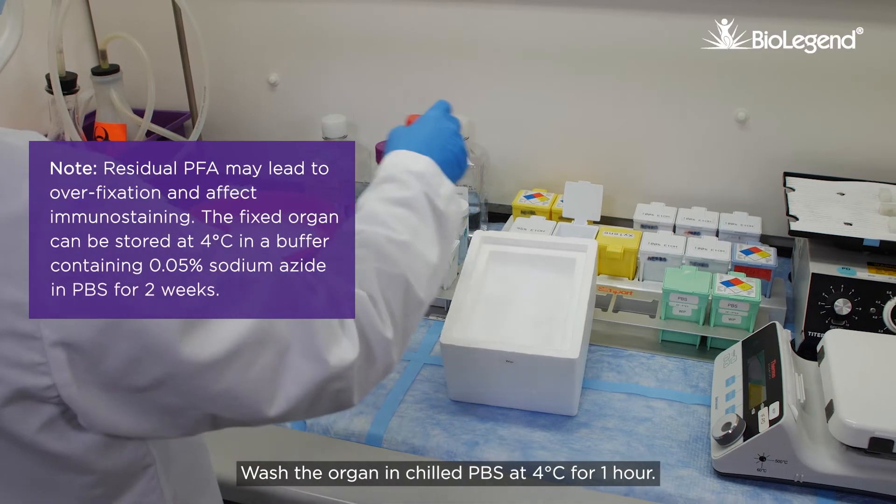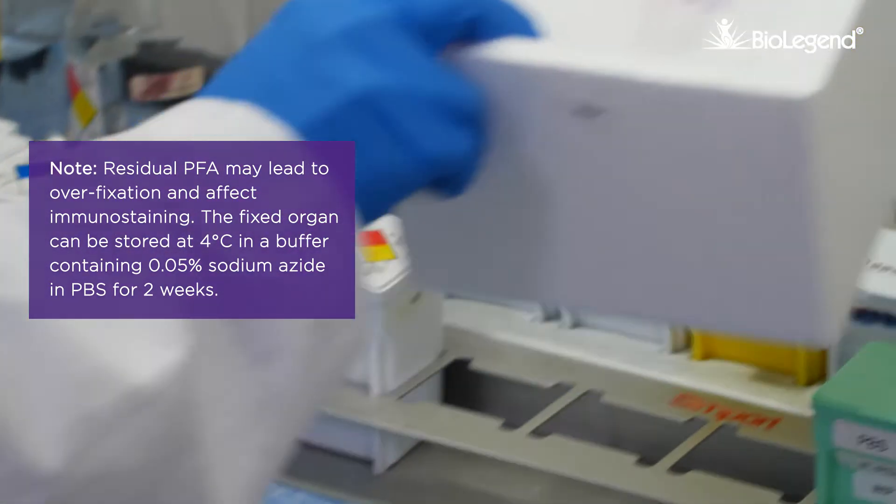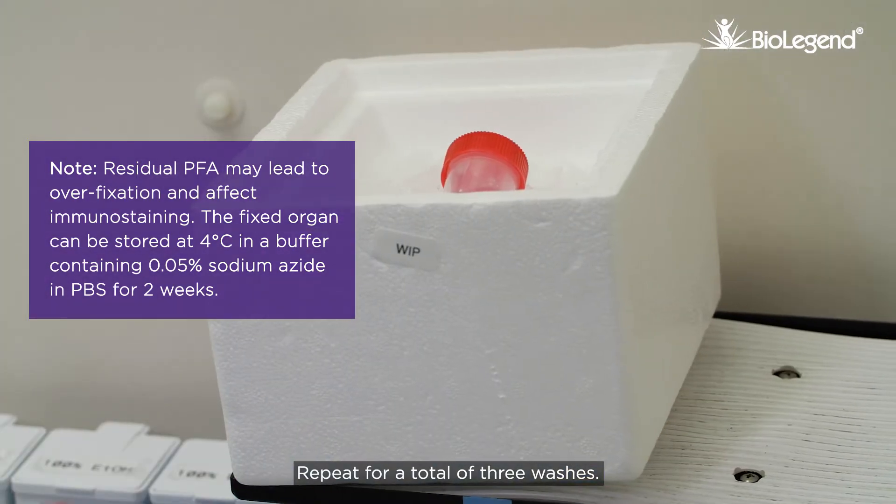Wash the organ in chilled PBS at 4 degrees Celsius for 1 hour. Repeat for a total of 3 washes.